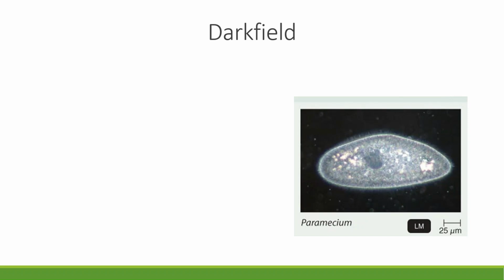As a result, the image is inverted and only the specimen is illuminated. This is really useful for visualizing organisms that can't be seen using bright field microscopy, typically those that don't stain very well or those that might have to be kept live while observing them, and you don't want to destroy them in the staining process. Brightening up only the specimen helps to highlight it when staining cannot be done.